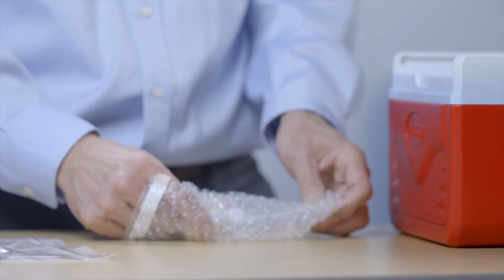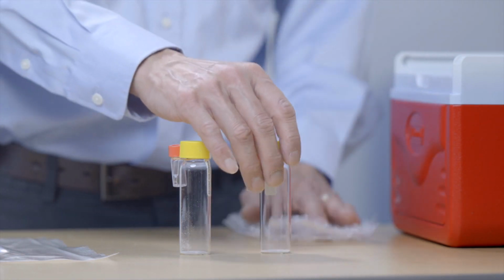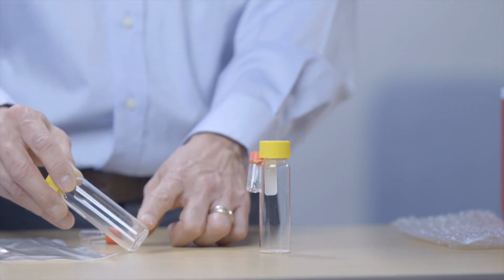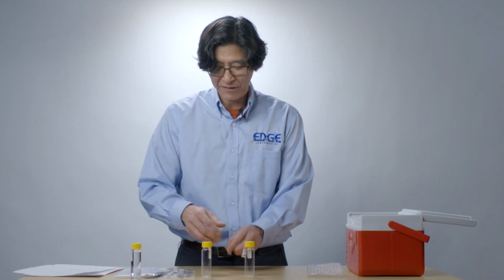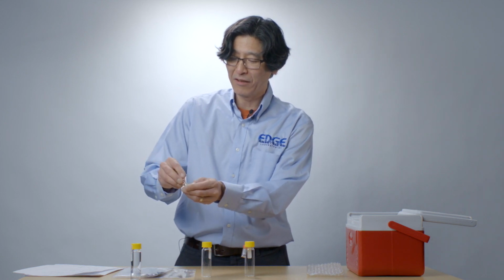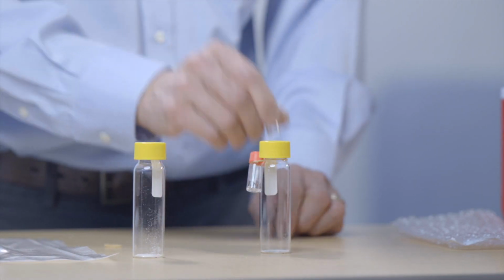Okay, and now we're going to look at our vials that we're going to sample with. There's 2 vials, so we're going to take a sample and a duplicate. Each one of these vials has a little bit of powder in the bottom. That's ascorbic acid. That's the dechlorinating agent for this. And then we have this smaller red cap vial. Inside this red cap vial is a little glass insert. So we will be taking the little glass insert and pouring this into our sample after we've taken it.